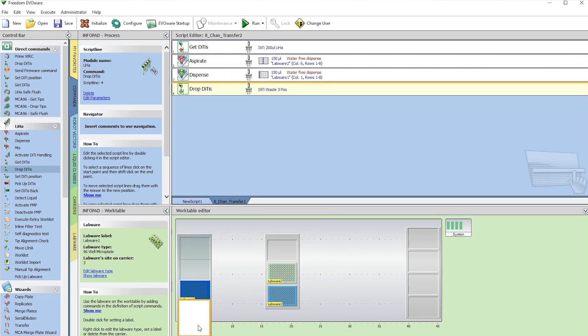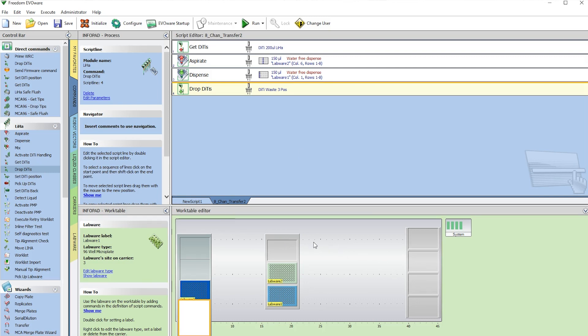First, we want to make sure that the deck, the physical deck, looks the same as our work table editor. If your deck isn't set up the same way, it could cause the 8-channels to crash and cause damage. Once you're sure everything matches and everything's clear, we're ready to press Run.